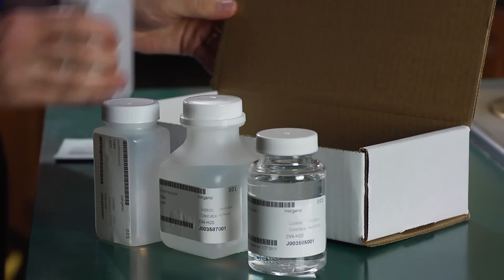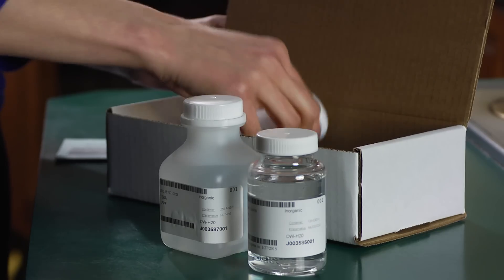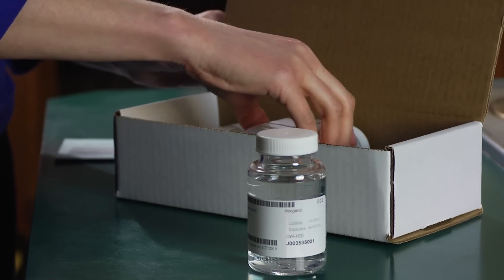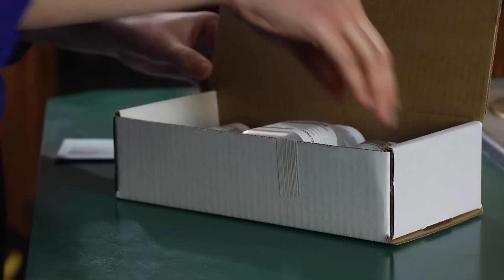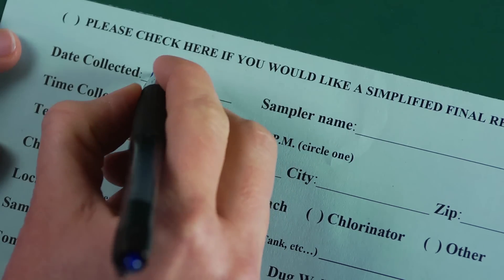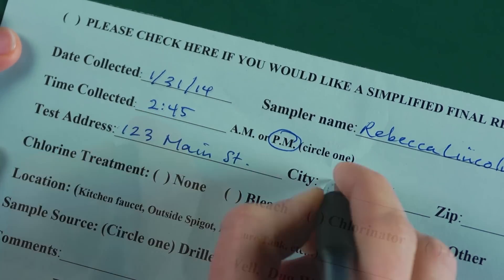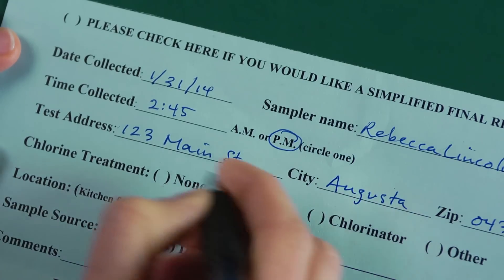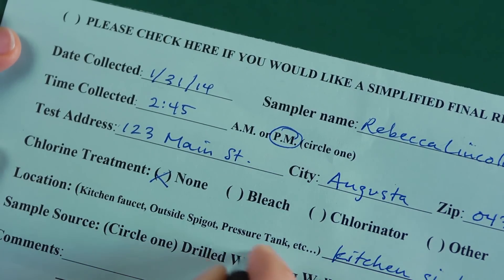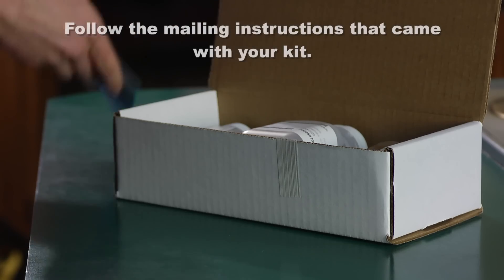All the bottles go back in the box they came in. Before you seal up the box, fill out the form that came with your test. It's very important that you write down the date and time you filled the bottles. The lab will probably want to know where you collected the water, what type of well you have, and if any chlorine treatment is being used in the water.